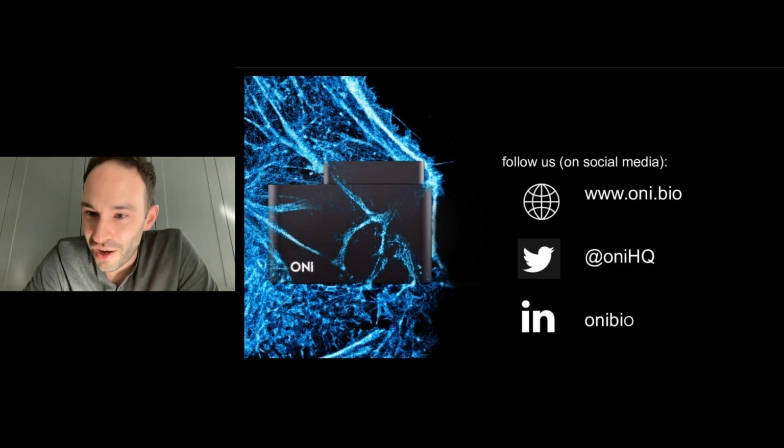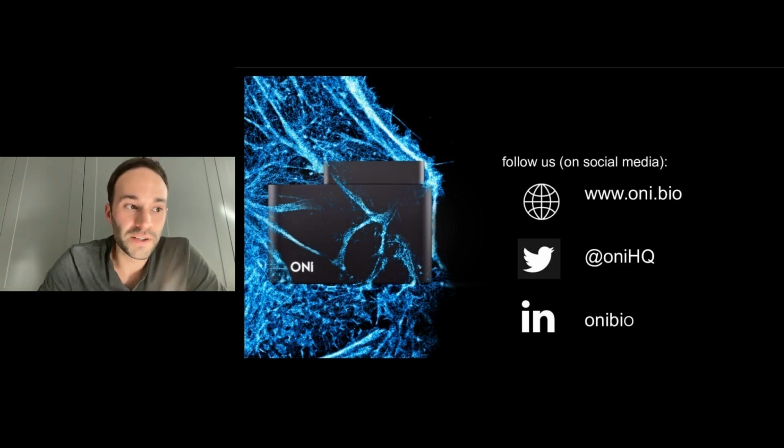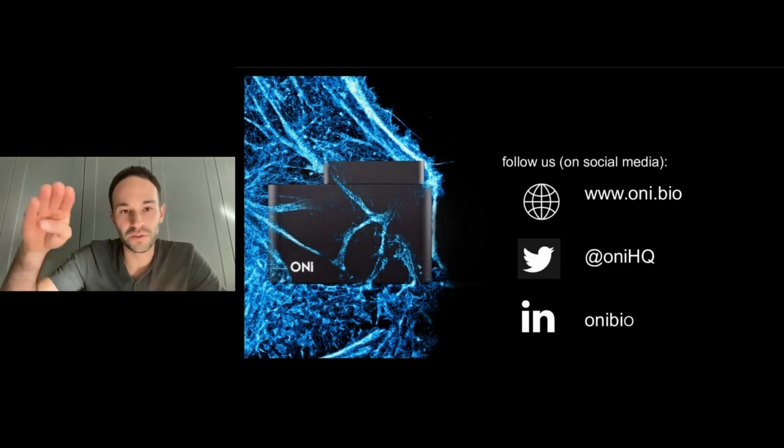Thank you. The question was, what's the function of the STORM buffer? So the STORM buffer, in this case talking about dSTORM, you need the buffer in order to induce the blinking behavior of the dyes. Most of these dyes don't blink spontaneously if you were to image them in PBS. Some of them do, but most of them don't. They would just be continually active until they bleach.